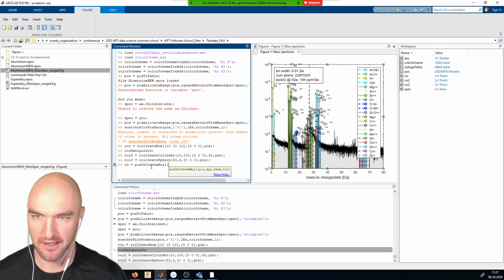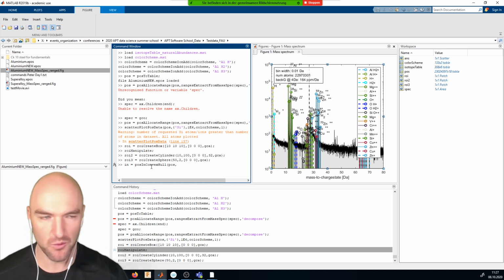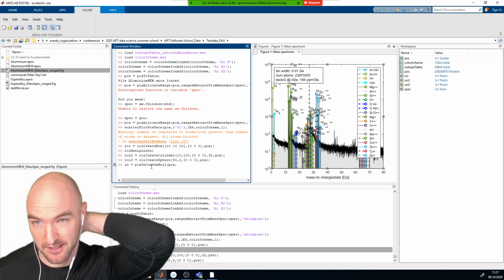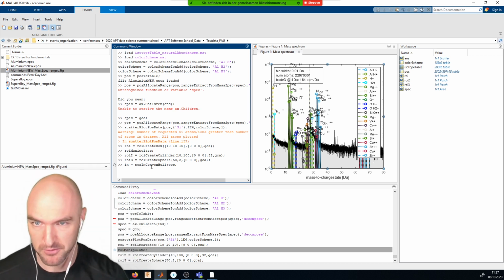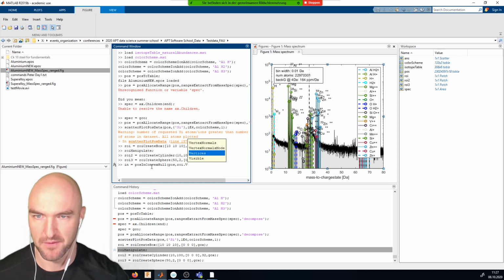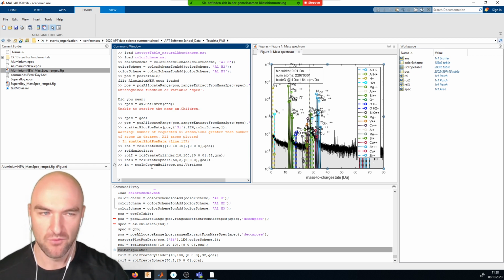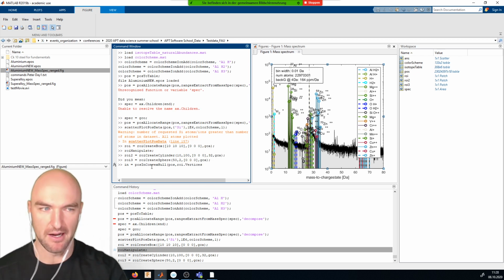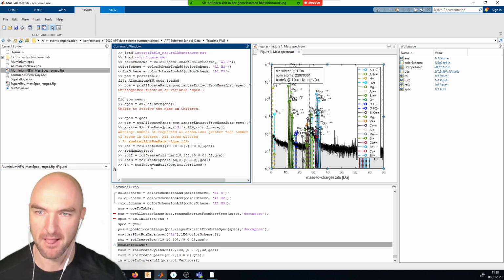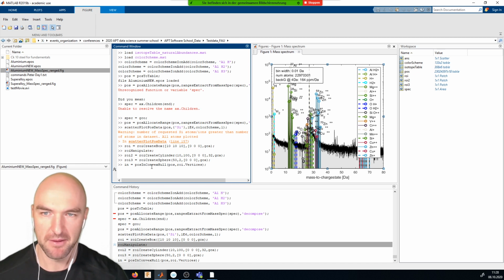And so we need the pos file, and then we actually don't need everything from the ROI object. All we need is the corner points of the ROI object. So the corner points of the ROI object are then ROI dot vertices. Vertices are points making up a graphics object. And then our containment test will run.